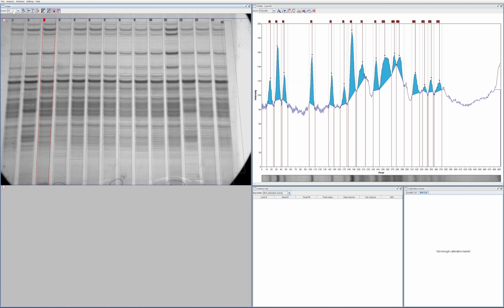So it's just added one right at the top of the lane and right at the bottom of the lane here. And that's exactly how we do it as well, but we just do it automatically based off your lane box. So that's exactly the same functionality as in Phoretix. So you can bend your RF curves here, which isn't a function that we have currently, but we will be adding in the future.